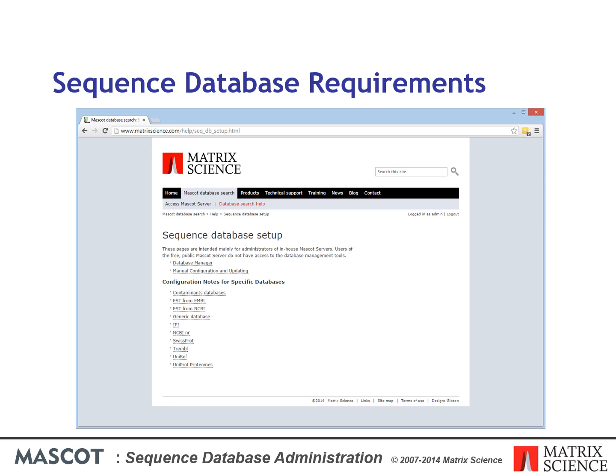For the latest information about the major public databases, refer to the help pages on the Matrix Science public website. The help pages in your in-house copy of Mascot are similar, but progressively become more out of date.